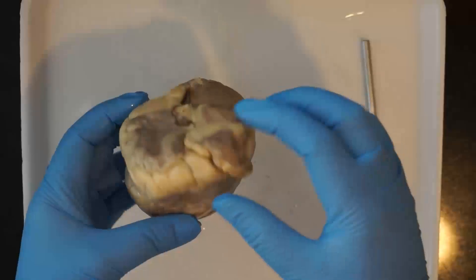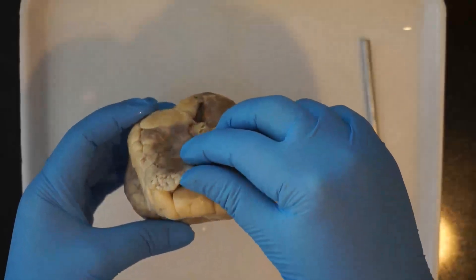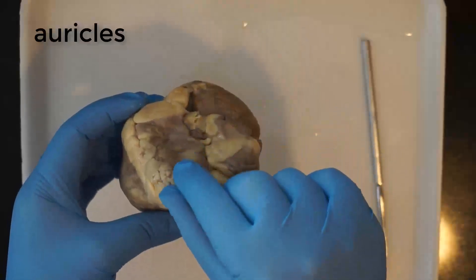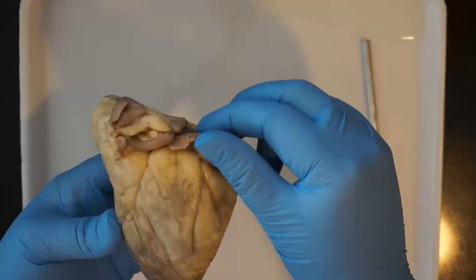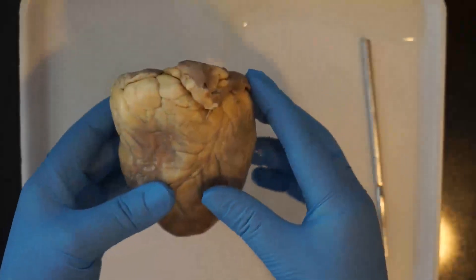The top two chambers of the heart, the atria, are covered by auricles. This is the right auricle and this is the left auricle, and those are named because they look like ears. They cover the atria on the top of the heart.